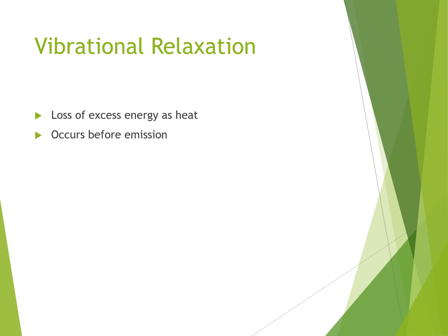After excitation, the molecules undergo vibrational relaxation. When the molecule absorbs energy by radiation, it goes to a higher energy level, becomes unstable and wants to become stable, so it undergoes vibrational relaxation and loses energy as heat.